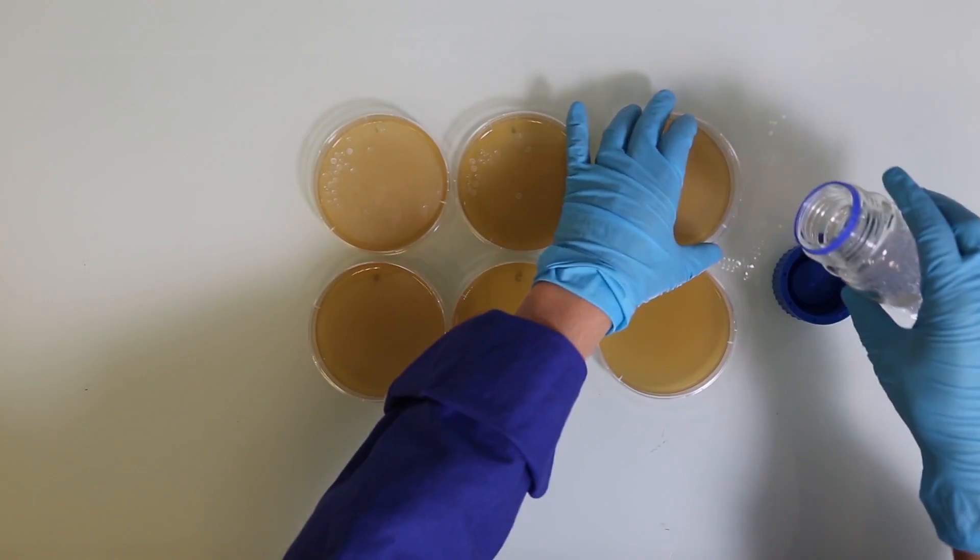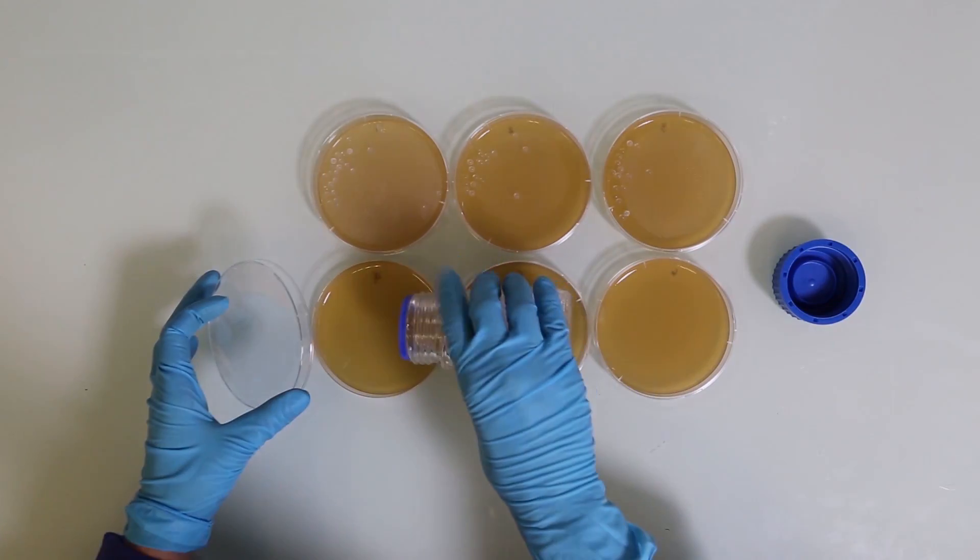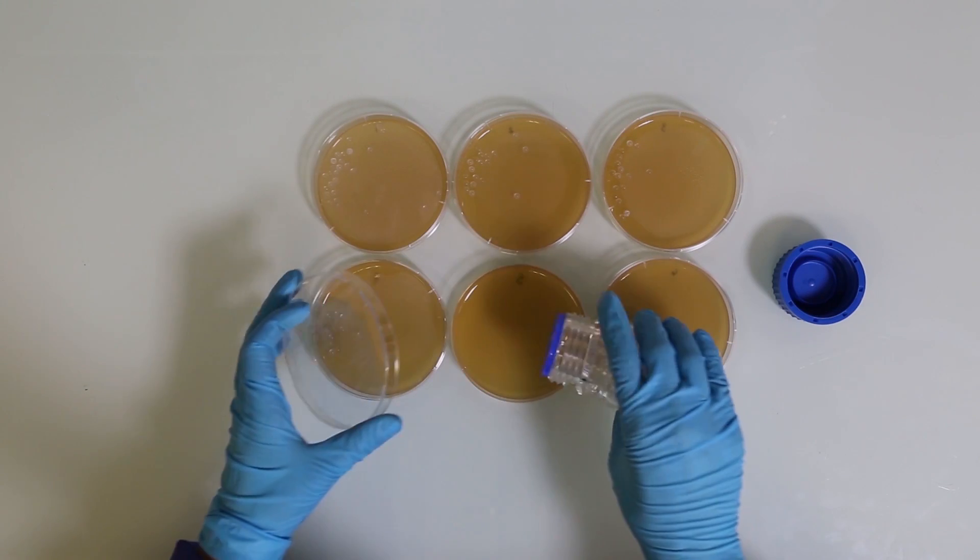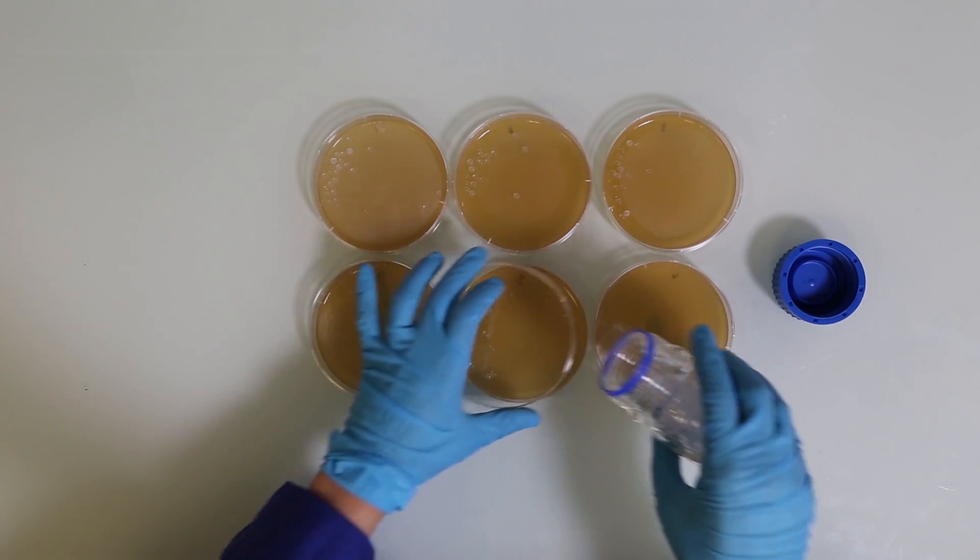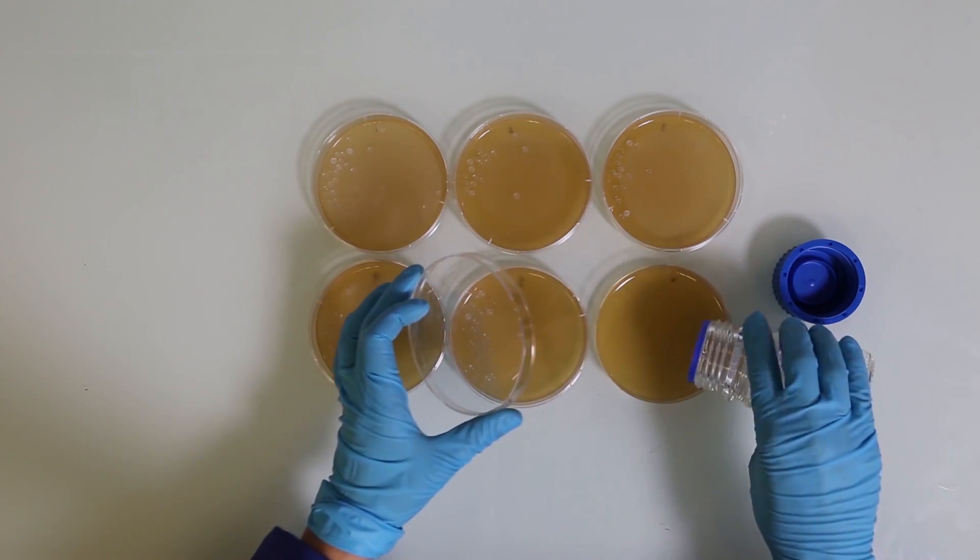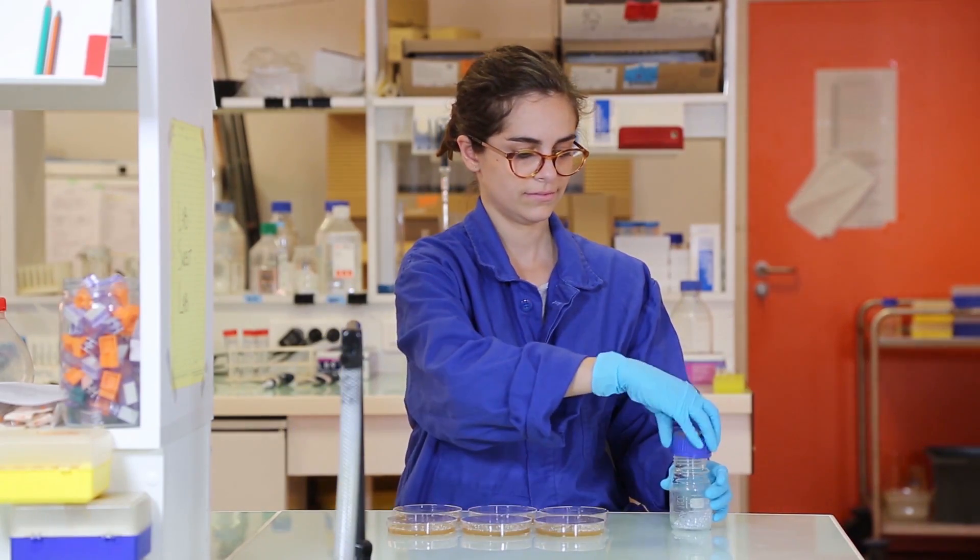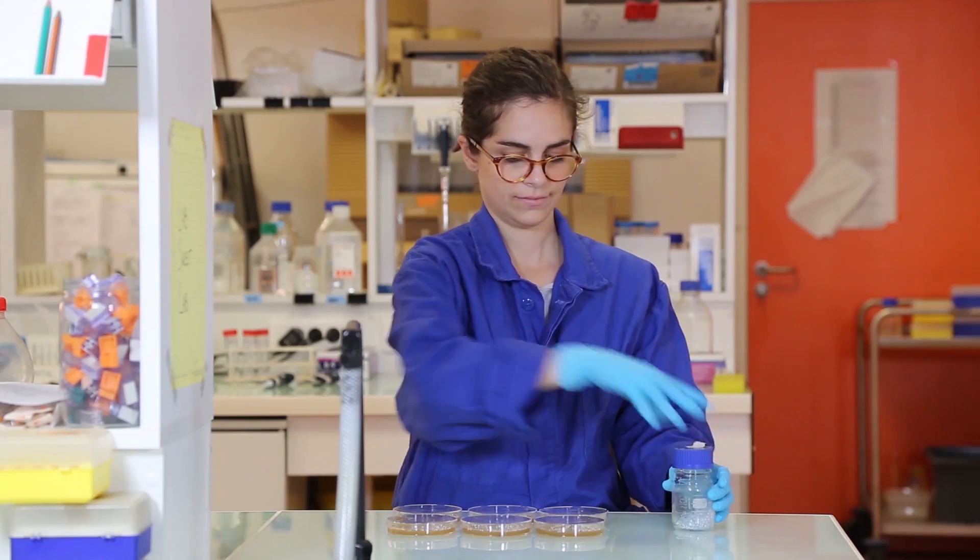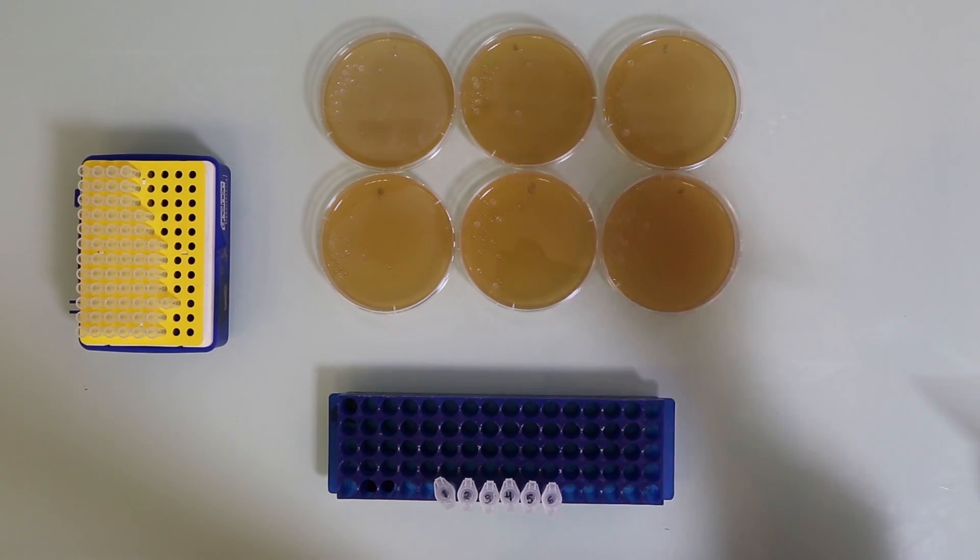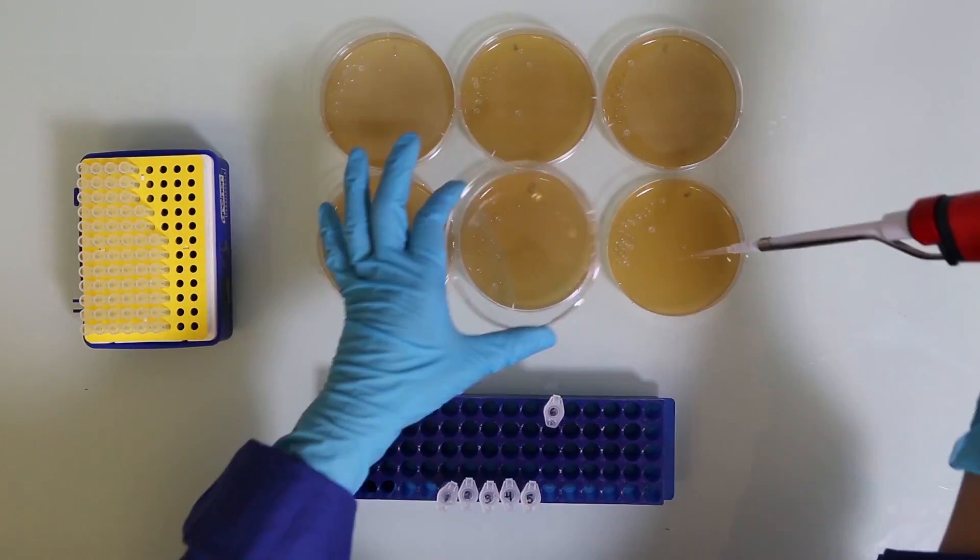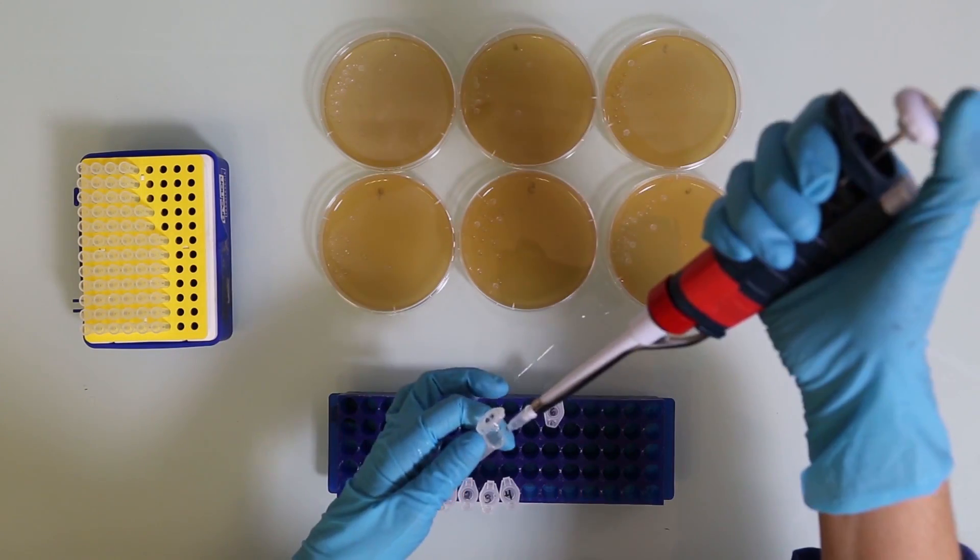Once we have our dilutions, we want to plate 100 microliters of each dilution onto our tomato-milk agar plates. Let's approximate that we have somewhere between 100,000 and 100 million CFUs per gram. Because we don't know for sure what our concentration is, we'll plate a range of dilutions so that we can make sure that at least one of our plates has an easily countable number of cells.